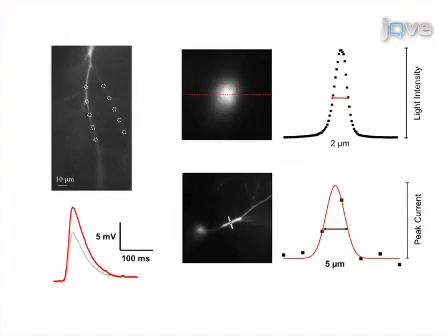Ultimately, results can be obtained that show experiments that were previously difficult to accomplish can now be completed relatively easily through multi-site photolysis of caged neurotransmitter employing the DMD system.